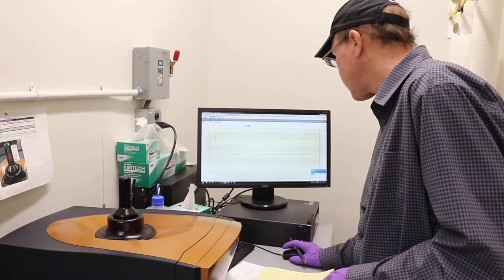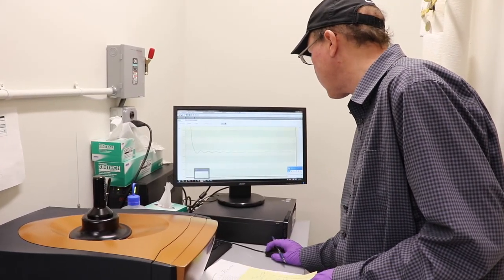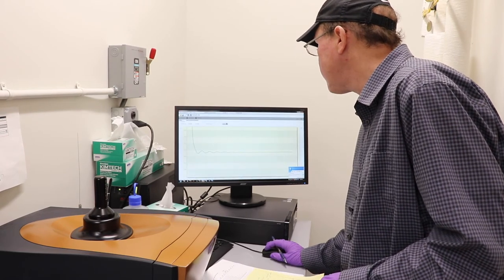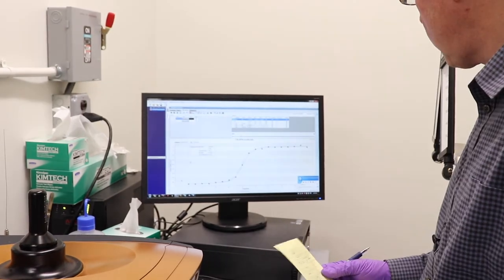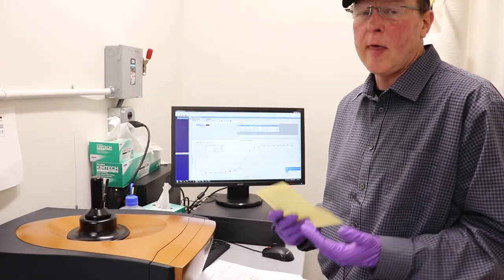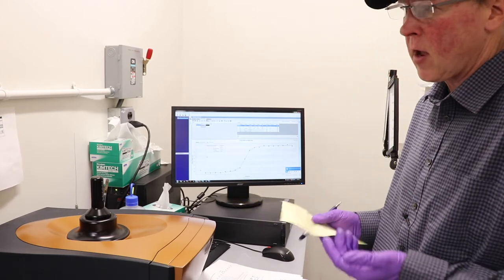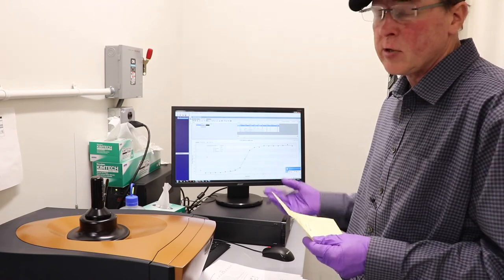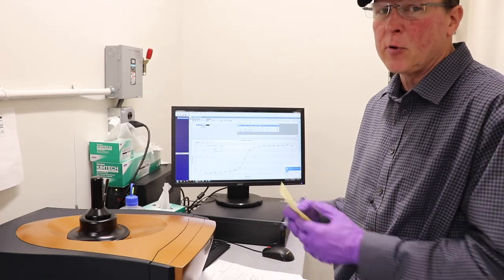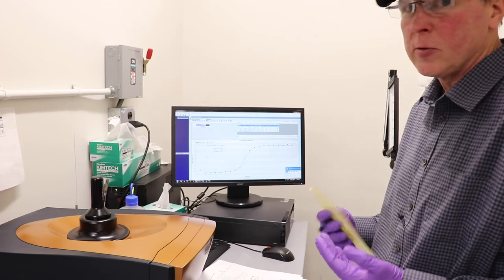Okay, so that's about it. We've seen how to run it with the ITC run program. We've seen data analysis here. Also, the company TA Instruments, their support is extremely good. You can contact them. In fact, on their website for support, you can attach files. Just attach your data files with a little description of what you're doing, and they can help you troubleshoot or plan further experiments to get the information that you want. So, thank you very much.